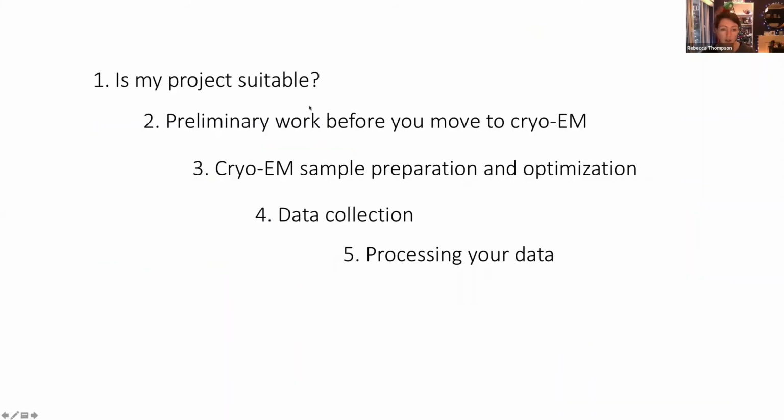So once you've got your grid and it's got a good particle distribution and you're ready to proceed to data collection, then this is where you can, if you had that grid already, apply from 2D classes to structure routes.